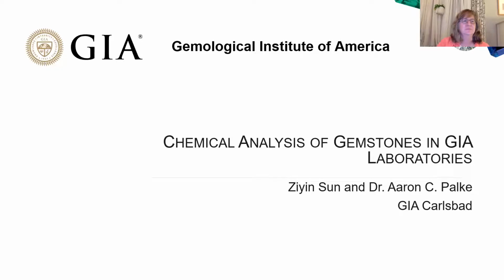Today, I'm going to share knowledge of how GIA uses advanced analytical techniques to analyze the chemistry of gemstones in order to understand the cause of color in gemstones, detect the treatments, distinguish natural from synthetics and imitations, classify gemstone species, and find out which country gemstones may come from.